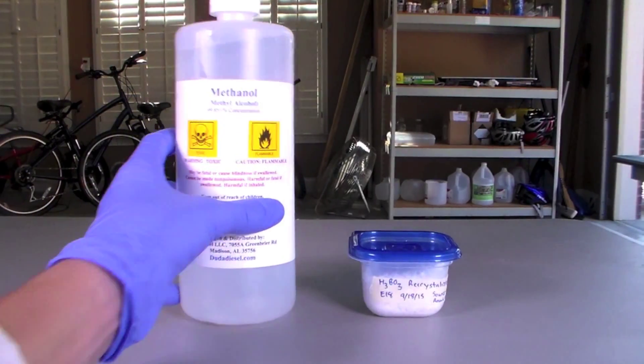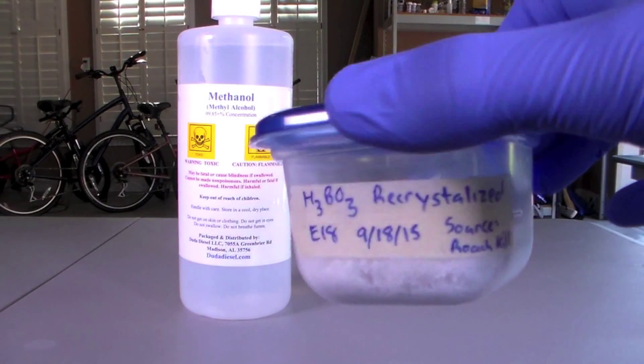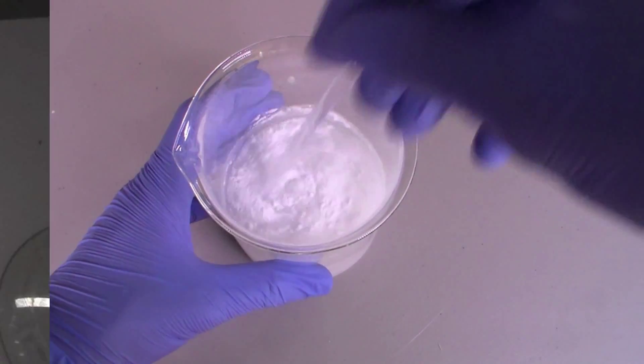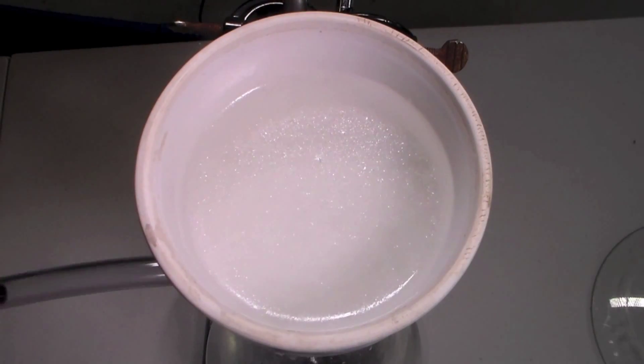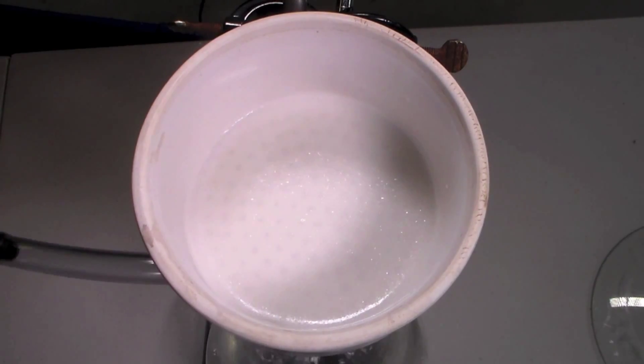The only chemicals you need for this experiment are methanol and the recrystallized boric acid that we made in a previous video. It is very important that the boric acid has been recrystallized because it must be as pure as possible for this experiment to work properly.